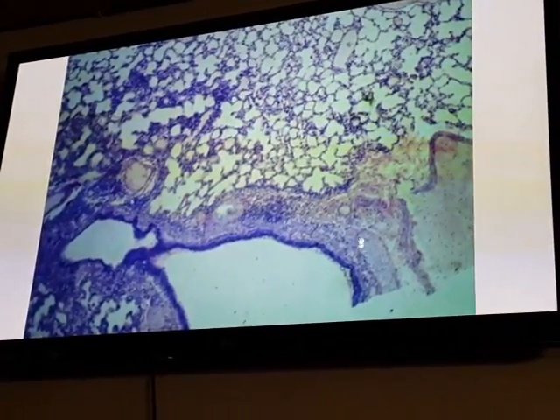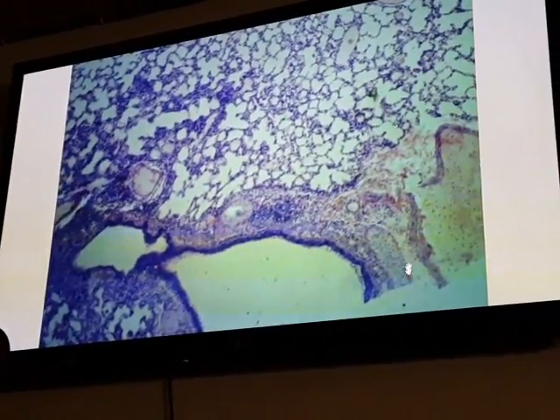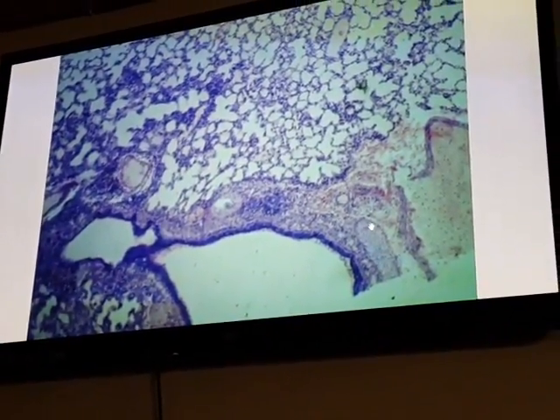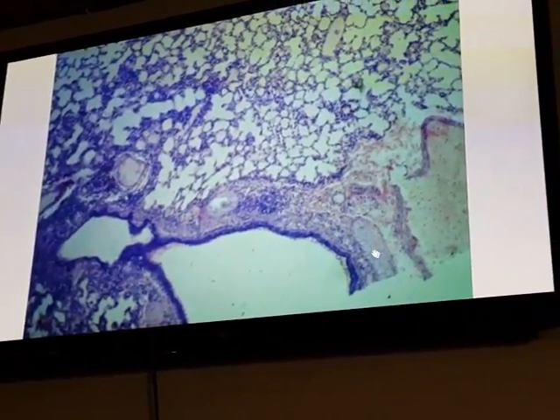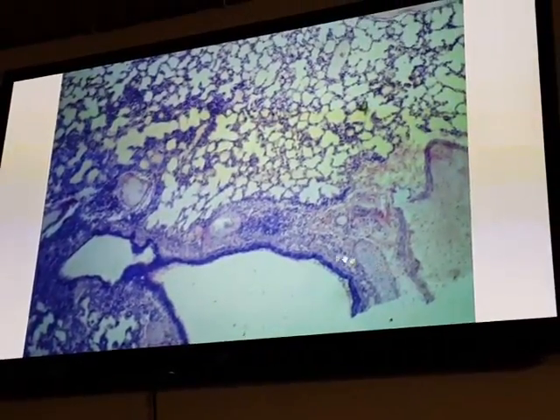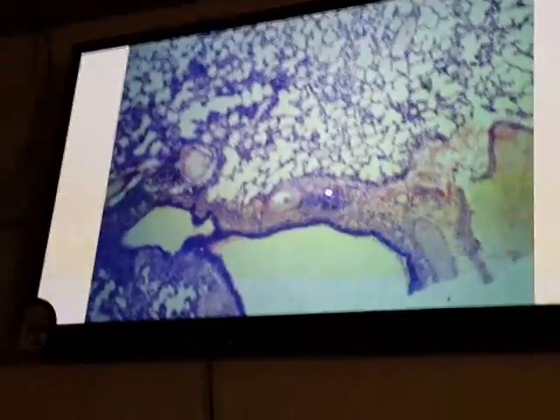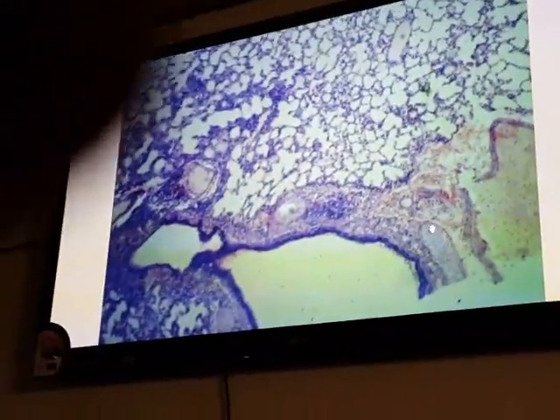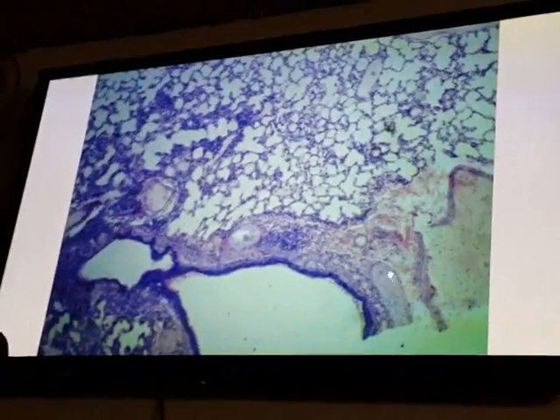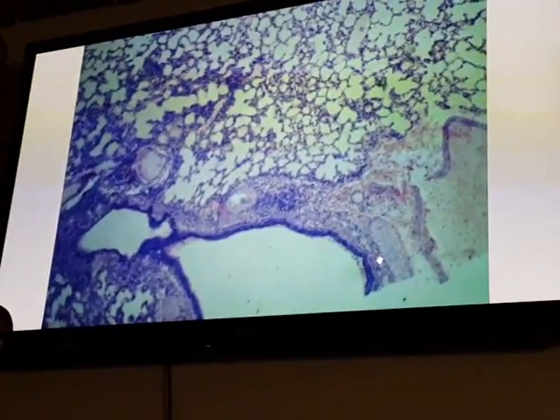We can see isolated plates or islands of hyaline cartilage. Look at this piece of hyaline cartilage. Through these structures we know that this is a bronchus. The lining is pseudostratified columnar epithelium, mixed gland, seromucous gland, and hyaline cartilage appear as isolated plates or islands.